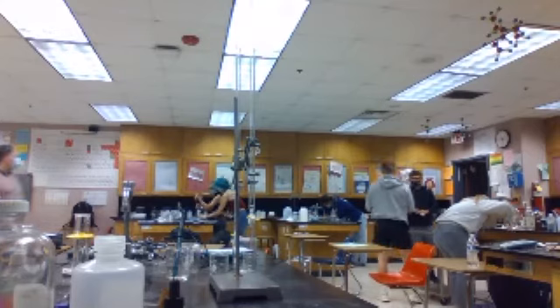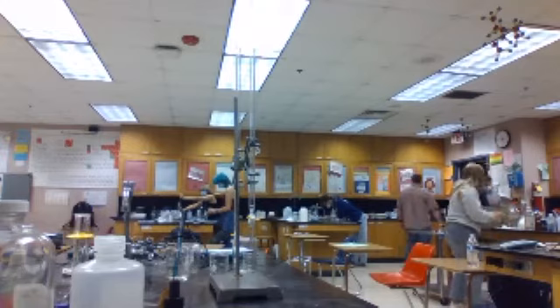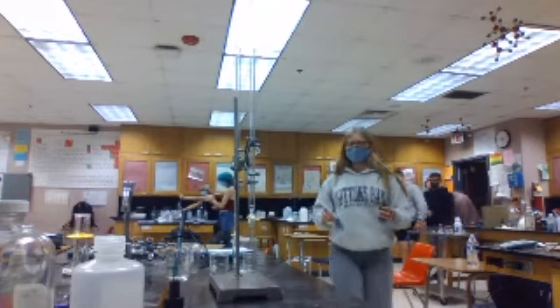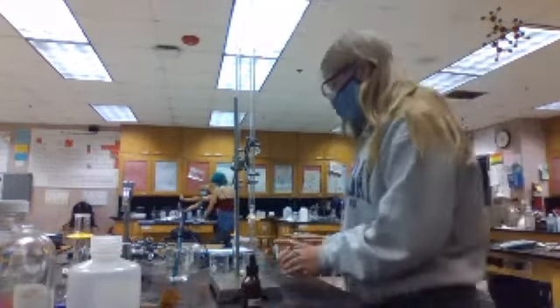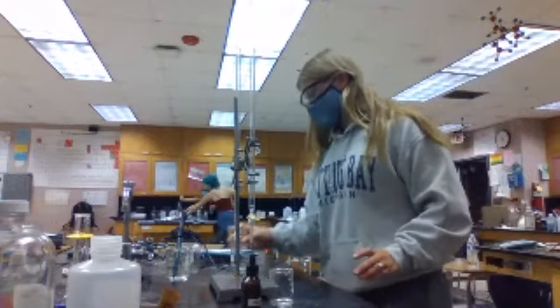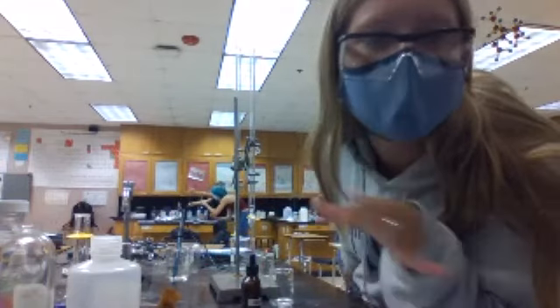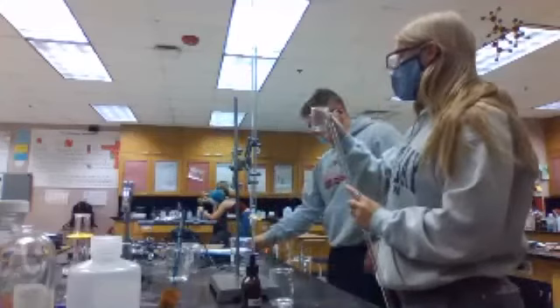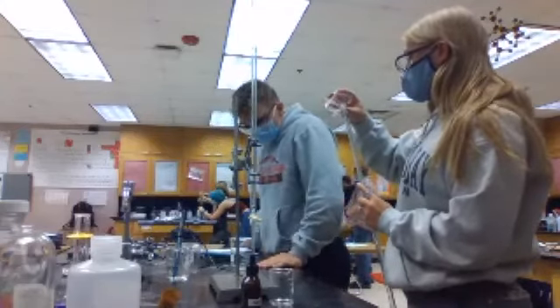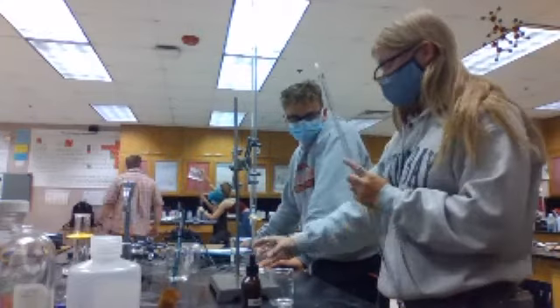Don't forget, you're using phenolphthalein, not bromothymol blue for this indicator, right? So phenolphthalein, get your drops up here, and there's a couple bottles of it. Same number, 4 drops. Okay, we're probably only going to get one trial done of this, so I'm going to put 10 milliliters into the, oh wait, I need to rinse the acid out first. Phenolphthalein, you guys got phenolphthalein over there.